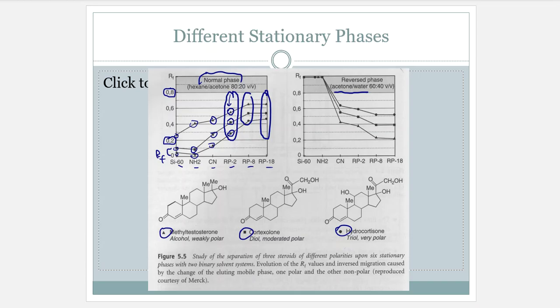You're like, well, wait a minute. There was acetone in the other one. Yeah, there was. But hexane is 80%. That's the majority. Hexane is nonpolar.